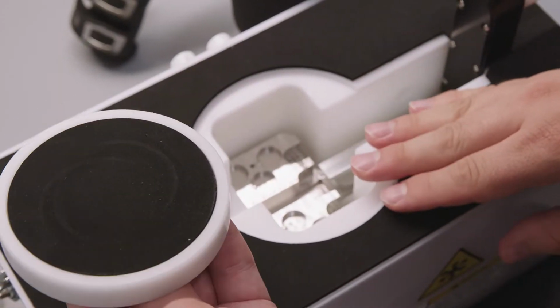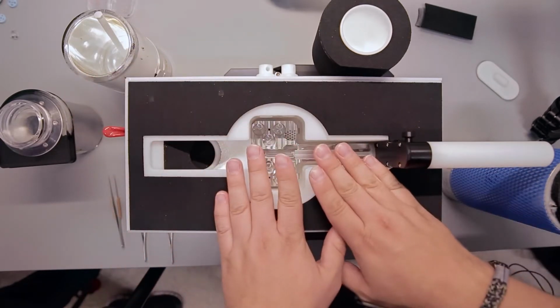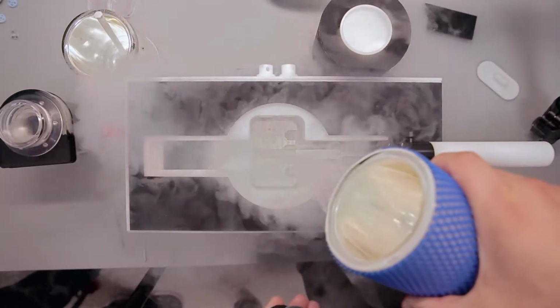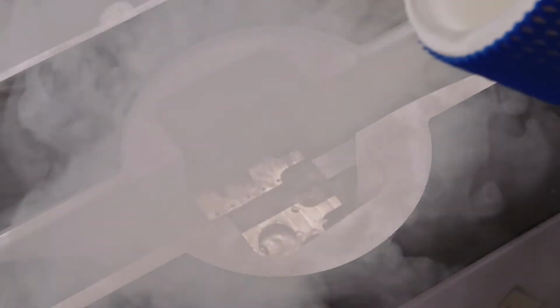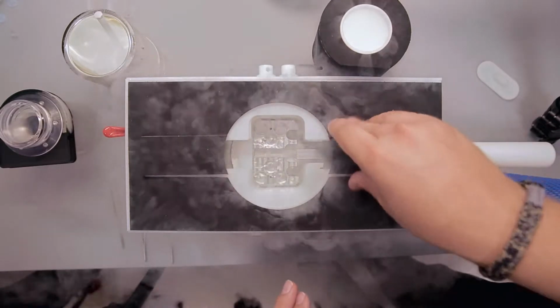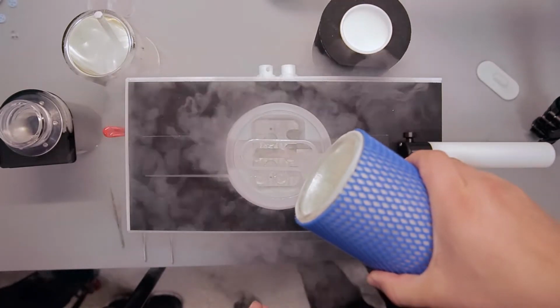So we are now using this plug down here to seal the hole so that we can start cooling down the loading station. Start to pour in liquid nitrogen. And you could put these lids on top and also pour through the hole here.